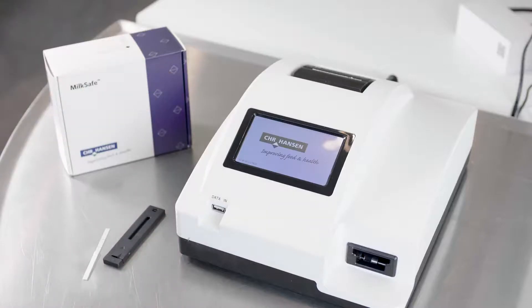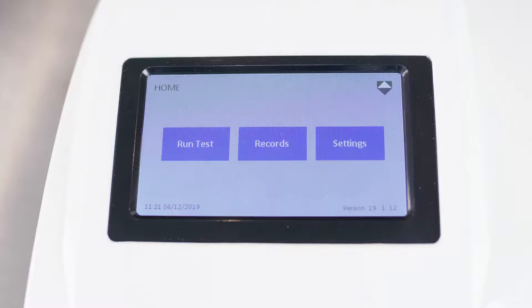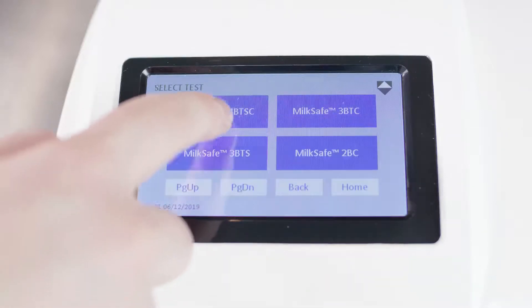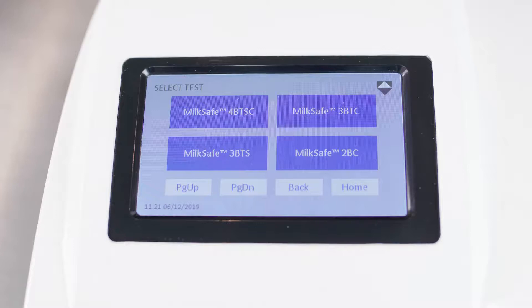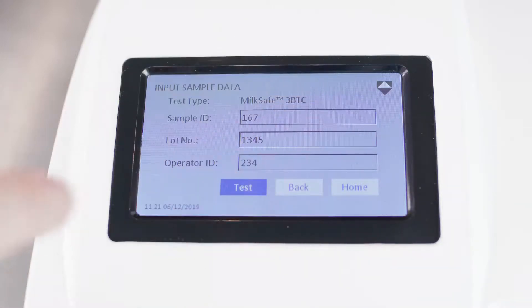Turn on the MilkSafe desktop reader. Select Test and select Qualitative for antibiotic tests. Now, select the test that corresponds to the test you are running. Enter the relevant information and press Test.